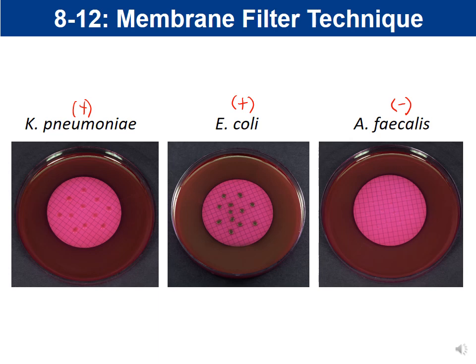The nutrient agar control plate for this would be the same as for the MacConkey. The MacConkey agar is also used for coliforms. You will not be tested on the MacConkey agar on the lab practical.